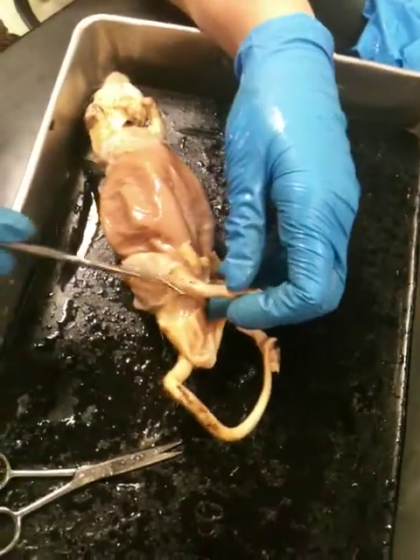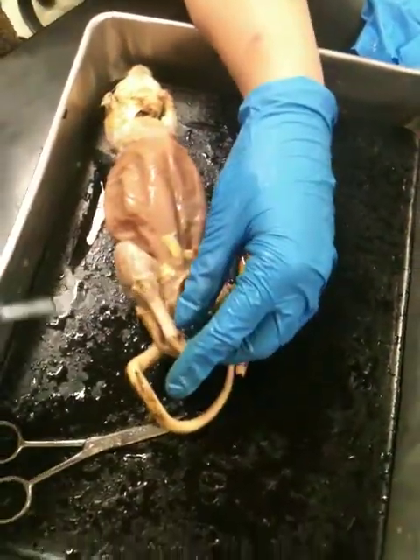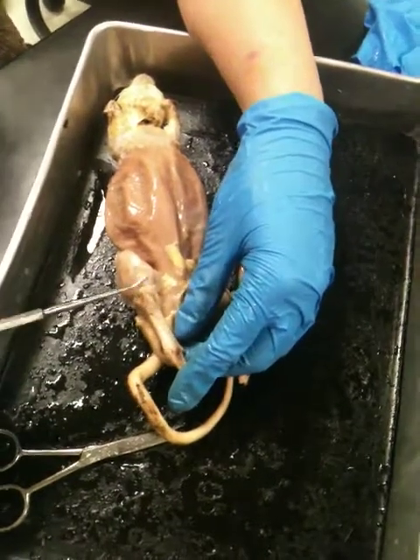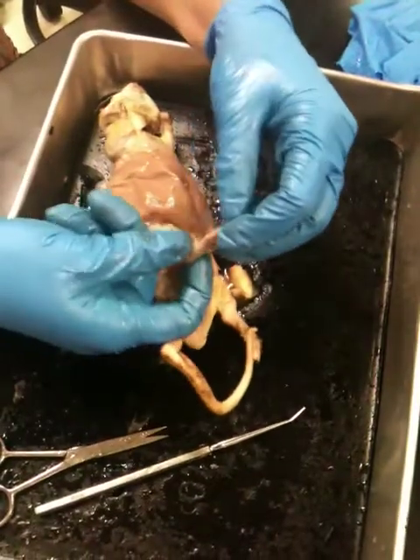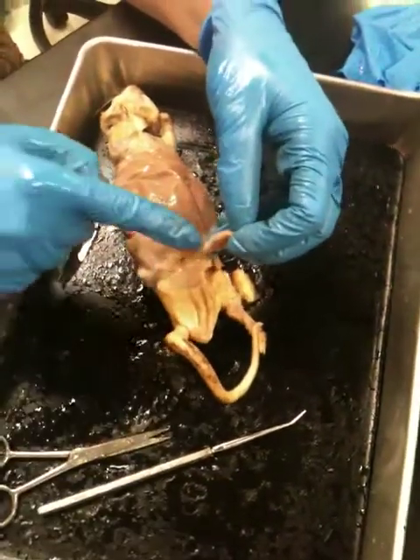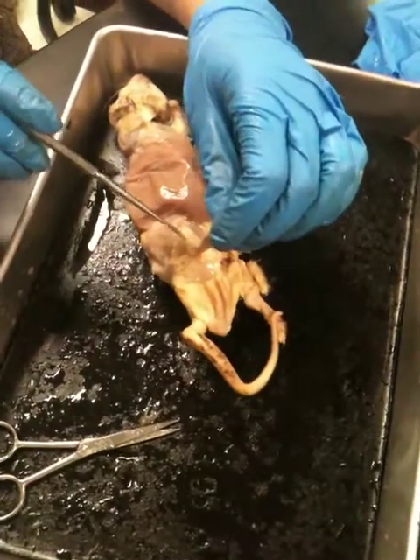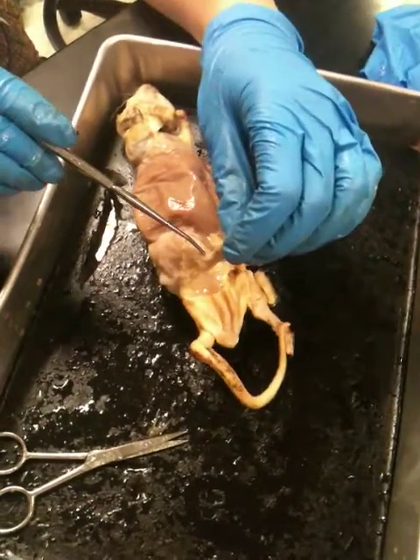Again, fibular, and the shin, I suppose you call this. This is going to be the crural. Now, lastly, you can feel these little points on each side. One right here as well as one right here. This is going to be the tarsal.